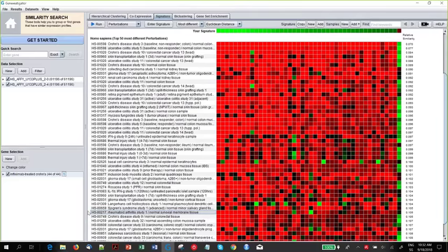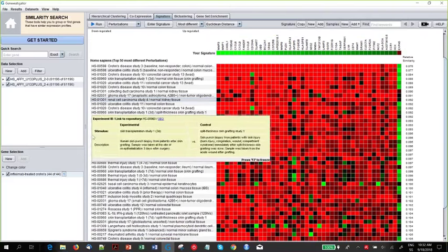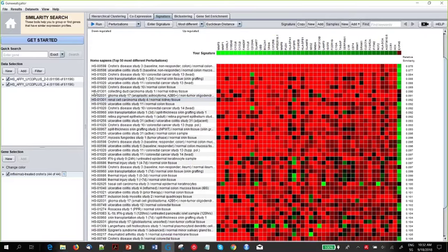An interesting observation that we can also find further on the top is kidney disease. So kidney cancers, actually we find two different subtypes of kidney cancer from the same data set here. So this is actually the value of the compendium-wide searches. And it demonstrates the importance of sample diversity and integrating samples from various organs, cell types, and diseases can bring you a lot of information just from one single signature that you have.